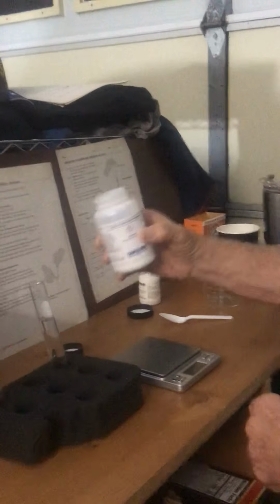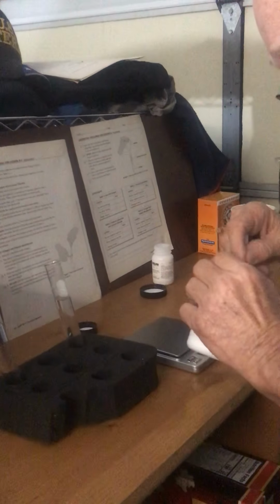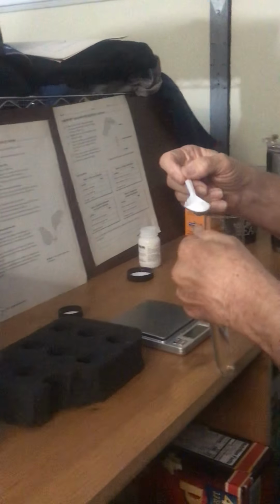And we have two test tubes, about 2/3 to 3/4 of the way full. What we're going to do is put some calcium chloride and some sodium carbonate in each one of these. Half a teaspoonful, or tablespoon. Is this a teaspoon or tablespoon? Something like that anyway. Okay, so here we go. I'm going to do that.